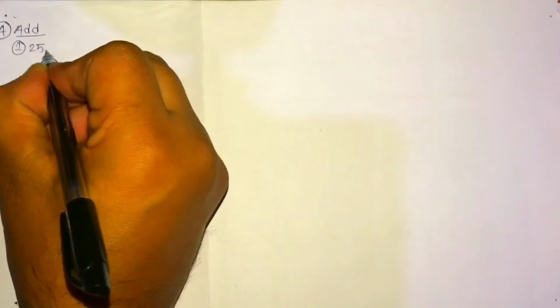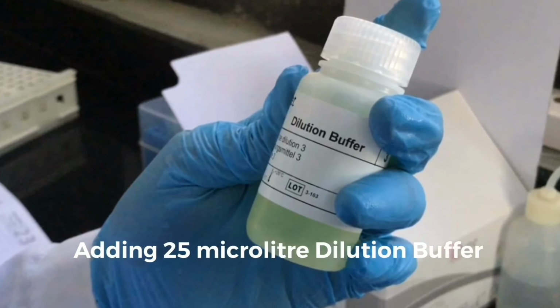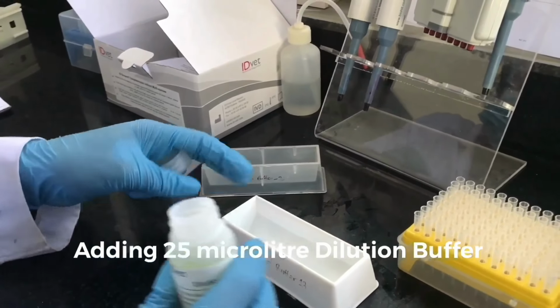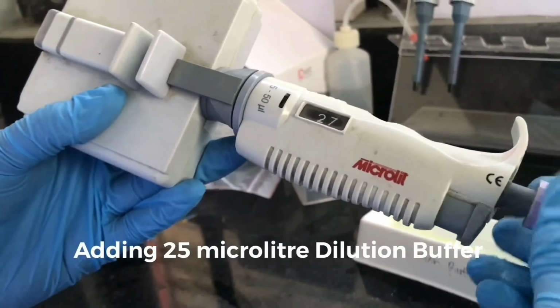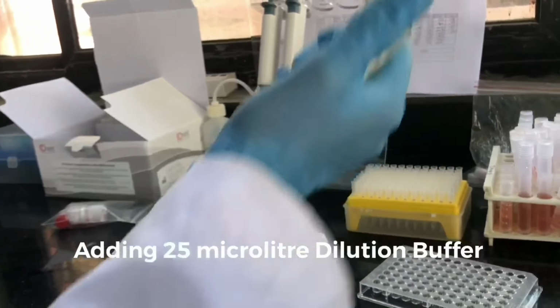Now coming to the steps of ELISA, firstly we have to add reagent to the 96 well plate. Firstly we will add 25 microliter of dilution buffer into the 96 wells, all of them. The dilution buffer is provided by the ELISA kit company, and it's in the kit box already, thus we use that. Adjusting it to 25 microliter.